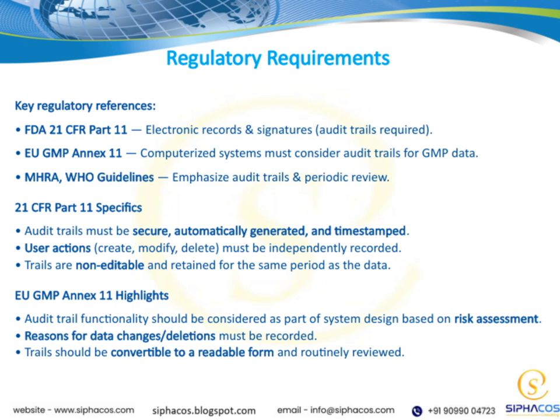Lastly, the MHRA and WHO guidelines reinforce the importance of audit trails and periodic review processes. Overall, these regulations underline the critical role of audit trails in maintaining data integrity, ensuring compliance, and supporting quality in our systems. Connecting all these points, it's clear that a robust, well-designed audit trail system is fundamental to meeting regulatory expectations and safeguarding our data.